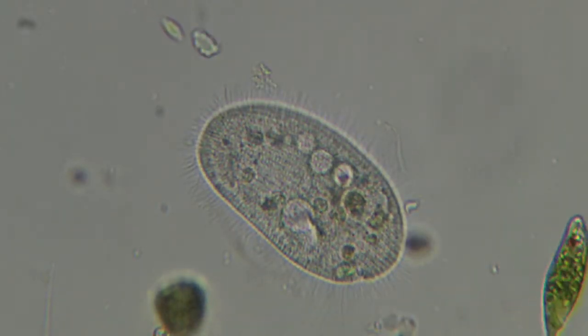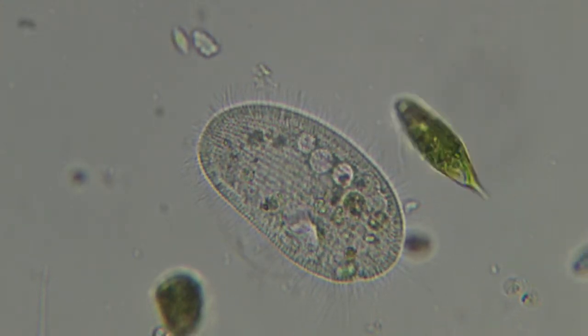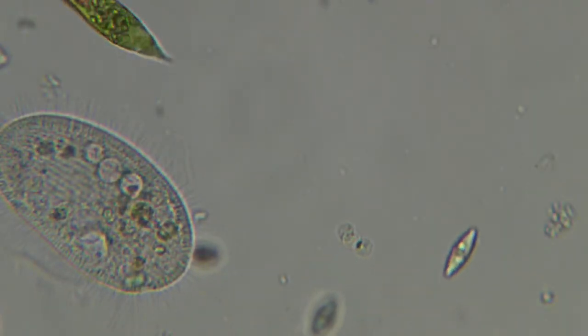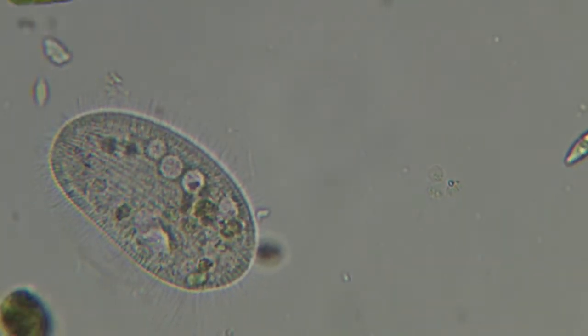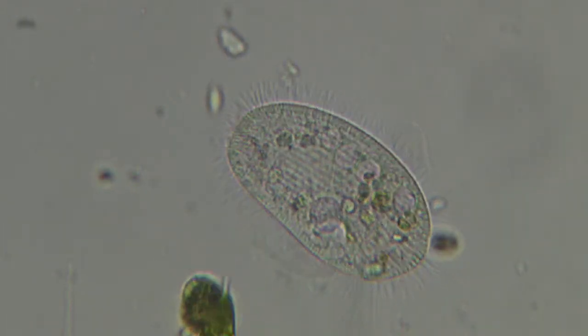Oh, look at that. It just spat some out. See that? You just saw exocytosis. That little cluster right there moving to the right next to the diatom, that was just shot out of the cell. Some spent vacuoles. Very cool.